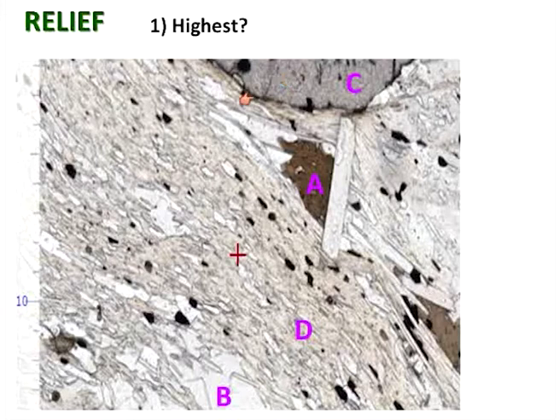And you can see that it's got a very distinct outline, so a very definite crystal edge, quite bold, and it also has a kind of mottled grey interior. And for many high relief minerals, that's absolutely diagnostic and very typical. And the reason for that is that any imperfections in that crystal show up rather like a crystal edge or a crystal boundary. So they have that same kind of high relief texture. And what that does overall is it gives this funny sort of greyish mottling, even though garnet is meant to be either colourless in thin section or a very pale pink. Usually you don't see that. You just usually see this greyish colour.